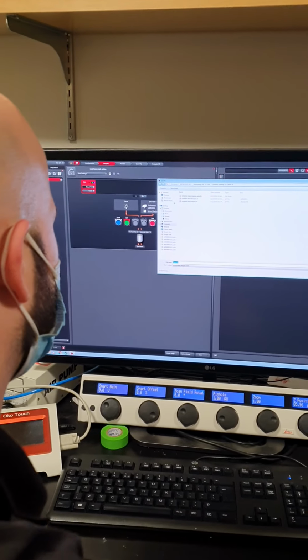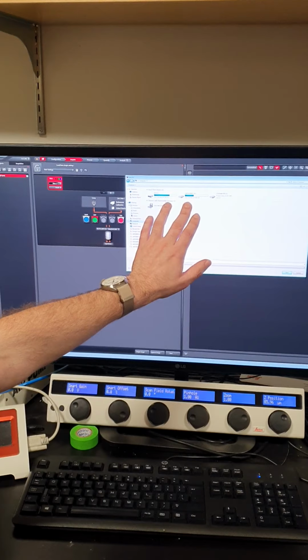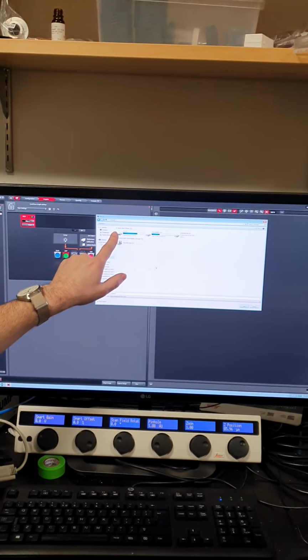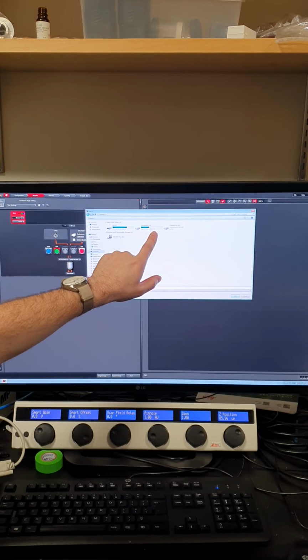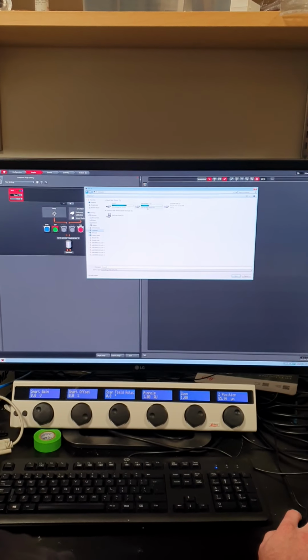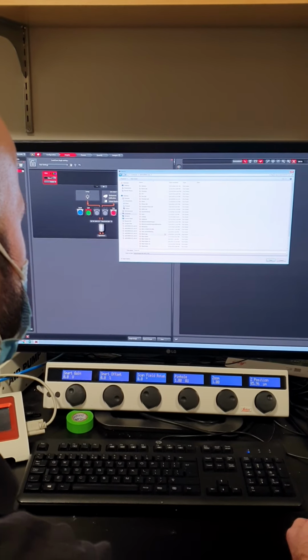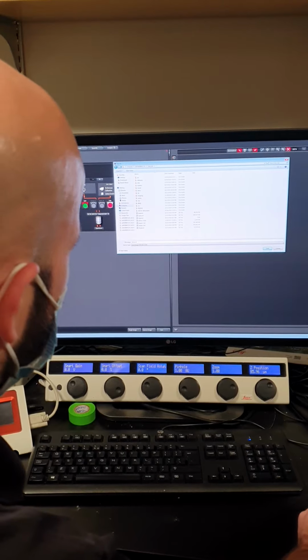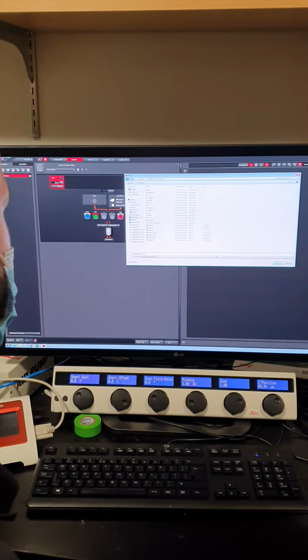And then if we go to my computer, you'll see that there's actually two hard drives on the computer. We have this small solid-state drive, which is just for the software. And then we have this 10 terabyte hard drive called Data Drive, which is where all your files should be saved. And if we click on that, we can see that each of the labs has their own files or folders. And so we can, for example, go to the DOS lab, and you can create your own folders here and save your data there.